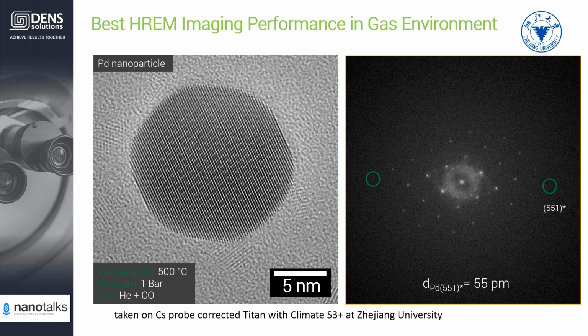Xiyuan Zhang is also asking if we could give a few extra words on how to optimize the catalyst loading on the chip, particularly for mass spectrometry, for calorimetry, and for TEM imaging. How do you optimize the loading of the sample? What do you do there?